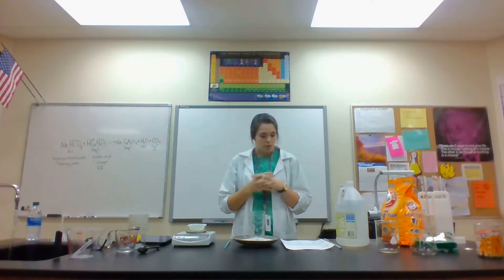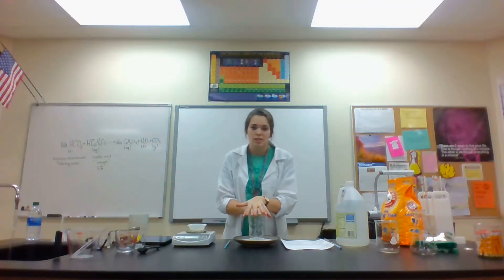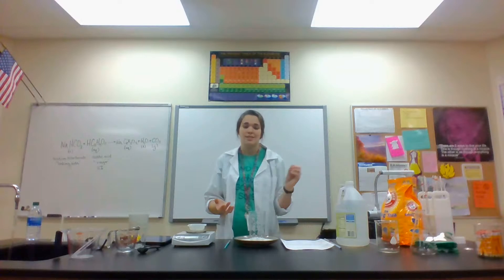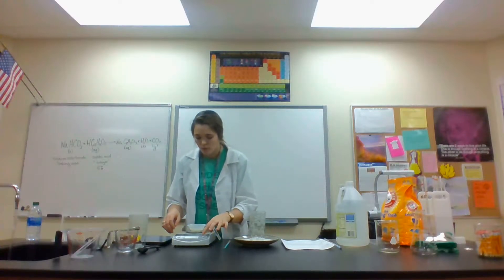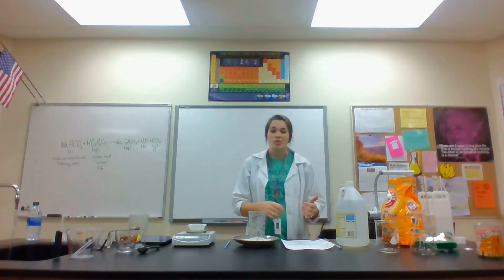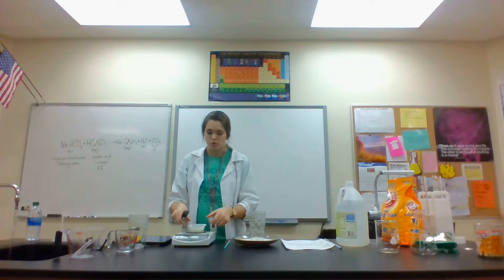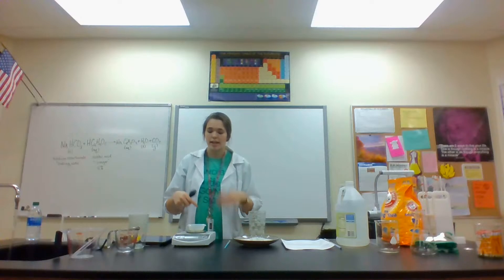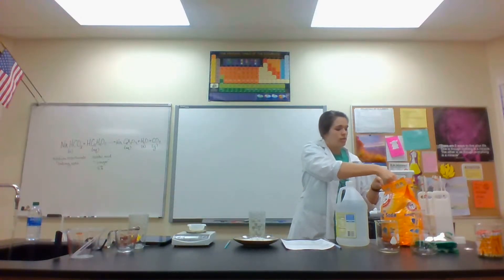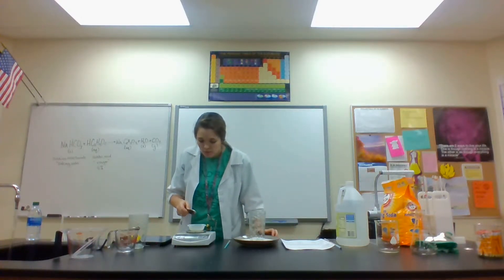First, measure out about four grams of baking soda for a small reaction, or eight grams if you want it to overflow — that's also two teaspoons. I'm going to do the big reaction, so I'll do eight grams. If using a scale, zero it out after placing your weigh boat so it doesn't count the boat's weight.